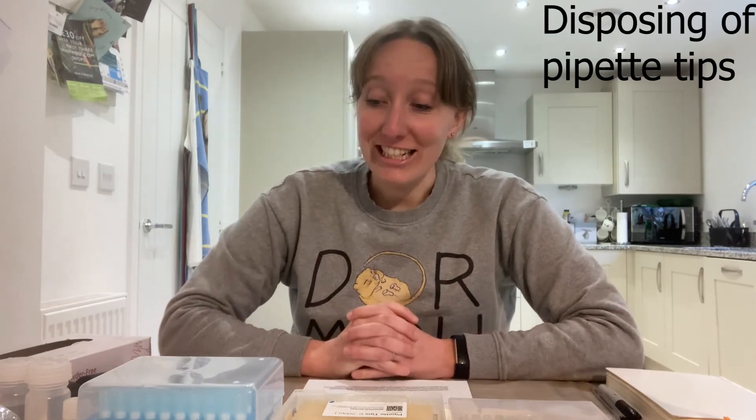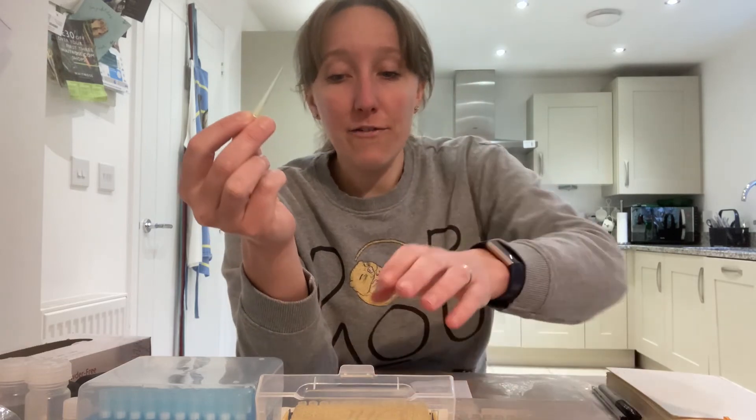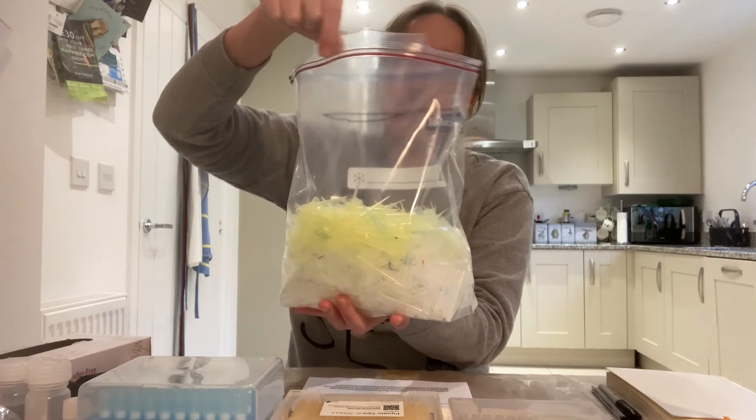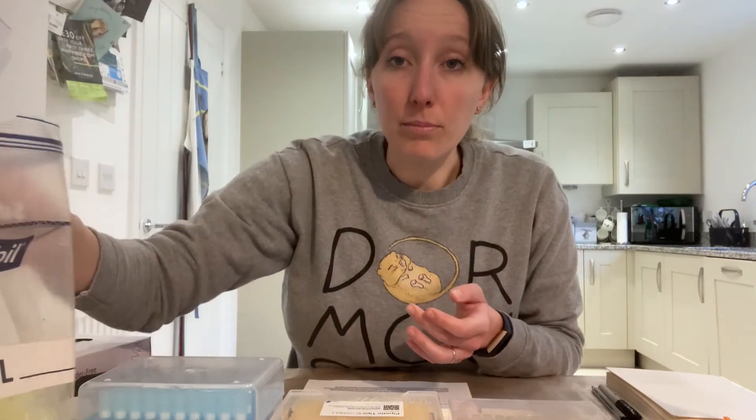A final tip about pipette tips: they are surprisingly sharp and I've found many times that if you empty them straight into a bin bag they will rip through the side when you're taking it out of your dustbin, which is very annoying. I recommend having a thick resealable ziplock bag or an empty yogurt pot to dispose of your tips in — when you've filled it you can seal the bag or put the lid on and dispose of it in your bin that way.